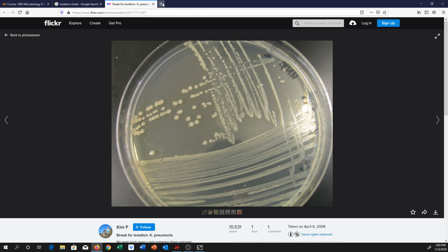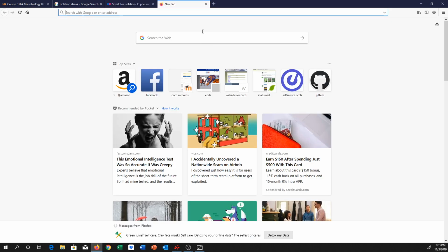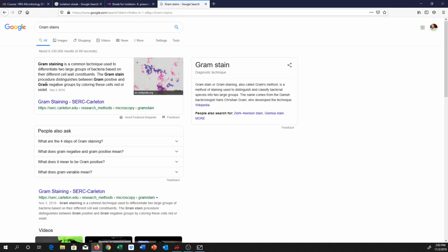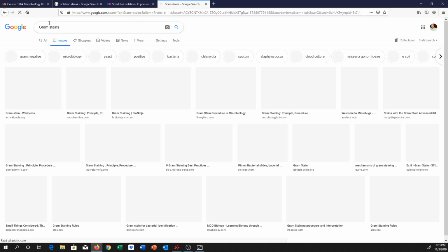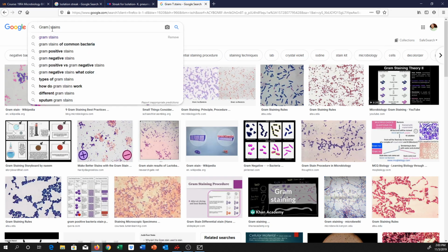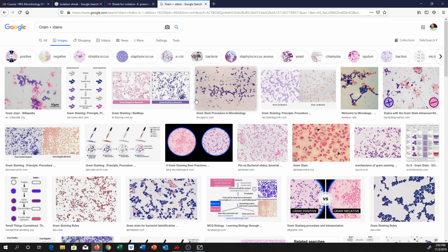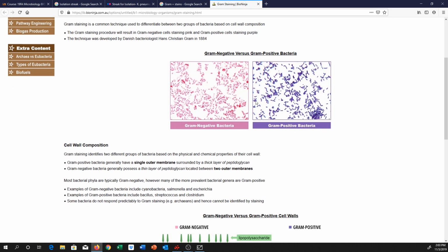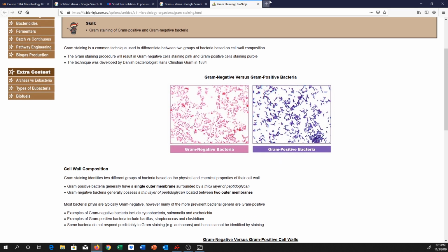And again, I'll be pretty straightforward with what I'm after. As far as gram stains, right? So let me do this so you don't get a mixed culture. So if I gave you one of these pictures, could you tell me whether they're gram positive or gram negative? Now, obviously, these are already labeled for you, and so you wouldn't get that in my quiz. But can you tell me one way or the other there?